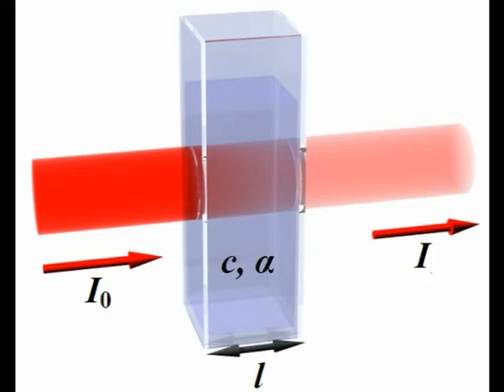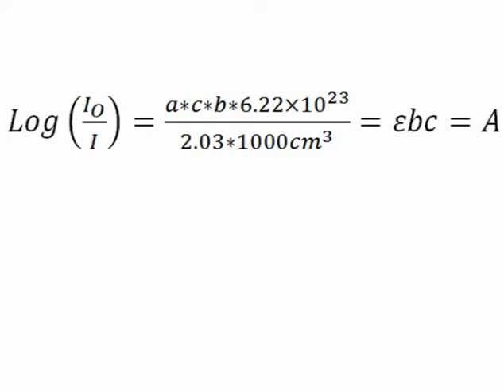Consider a simple container that has an area S with a length B and a substance with concentration C, with a great absorption alpha. We can define a model that considers the photons are absorbed instantly. If we consider a differential area dS in which a photon was absorbed, and divide this differential area by the total area S, we obtain the probability of photon capture.